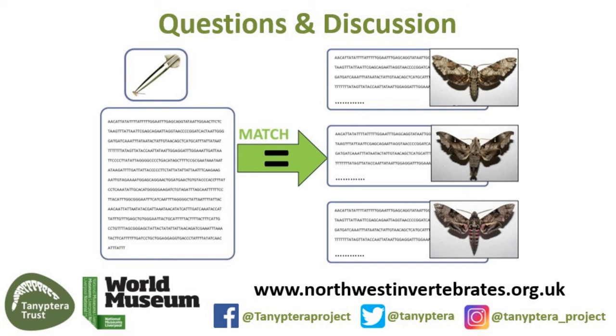We've got a question from Chris Workman. If the barcodes are based on the single mitochondrial gene cytochrome oxidase with 650 nucleotides of possible variation, how much overlap or how many variations can show up between the species? Right, so it's generally about 2% difference that is used as a very crude threshold. If the sequence of your unknown is within about 2% of one of those reference library sequences, you could assume that it's the same species. If it's over 2%, it's suggesting that it's a different species. So that's what's used as a crude cutoff.